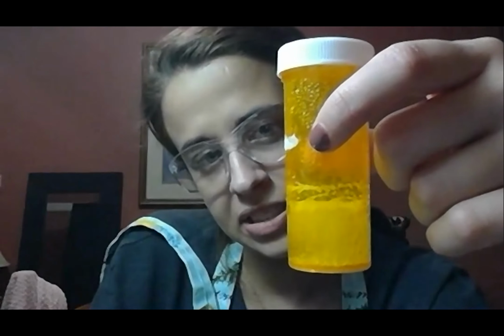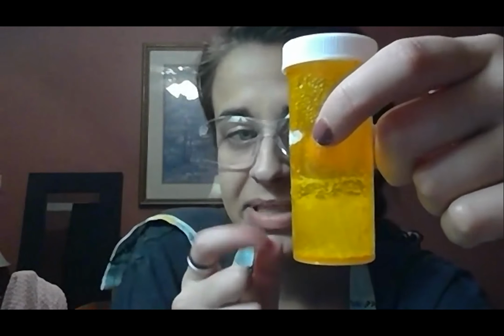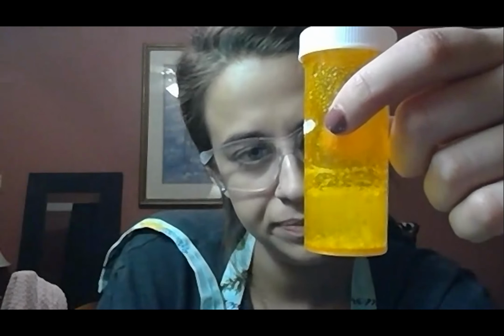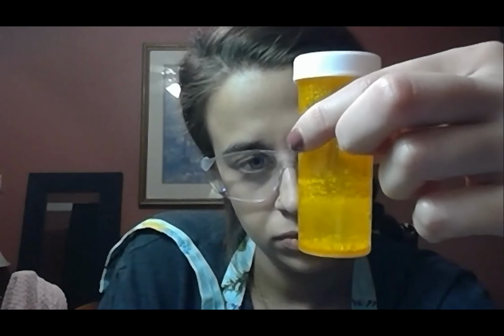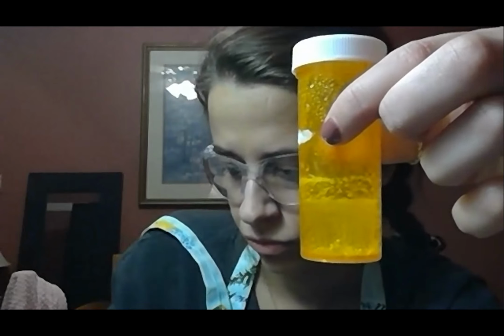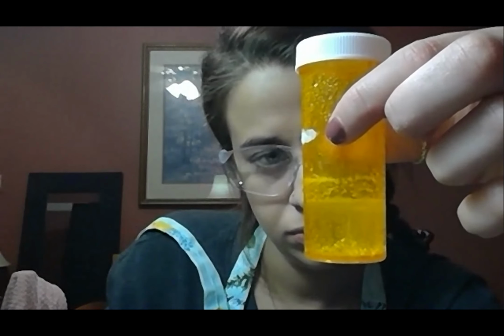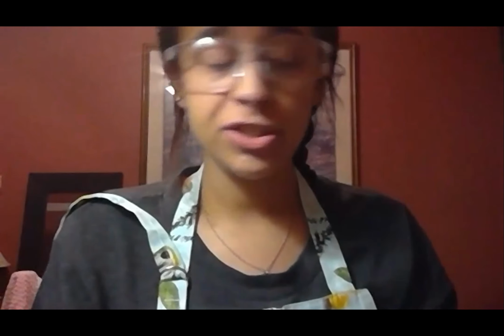So we're basically just gonna time it to when we stop seeing bubbles actively forming. Okay, so it's definitely slowed down. So that one we're gonna clock at about 42. Let's do 42 seconds.